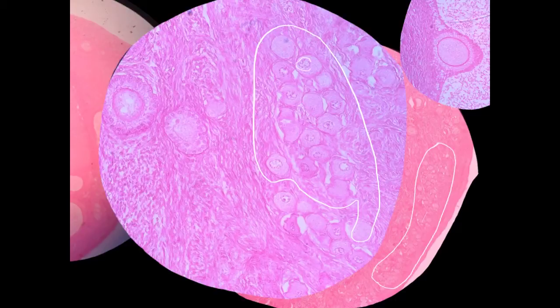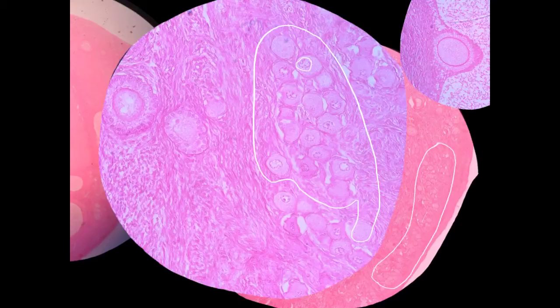In the center is an oocyte, the actual developing egg. The follicle has a squamous border around it. Just to be clear, the follicle is what's holding the oocyte. See how the border is almost invisible? It's squamous cells surrounding the oocyte with some fluid in the middle. These squamous cells form the edge of the follicle.